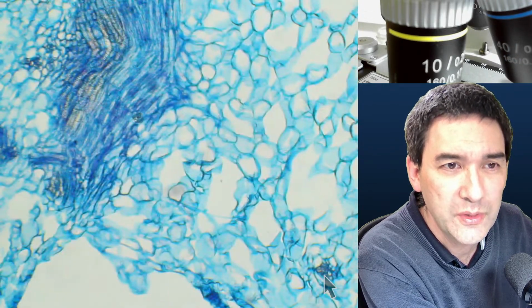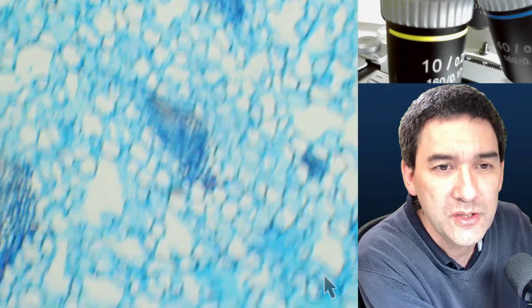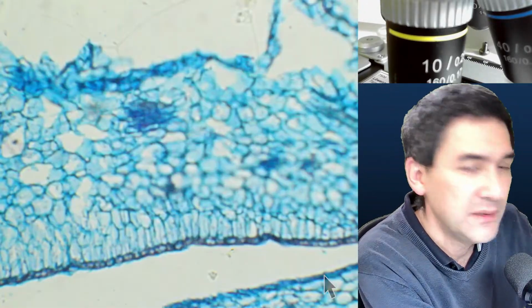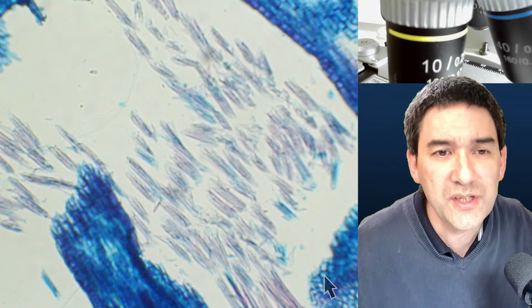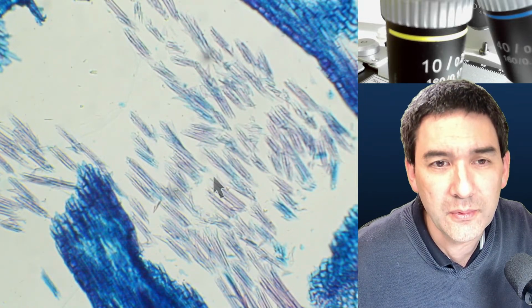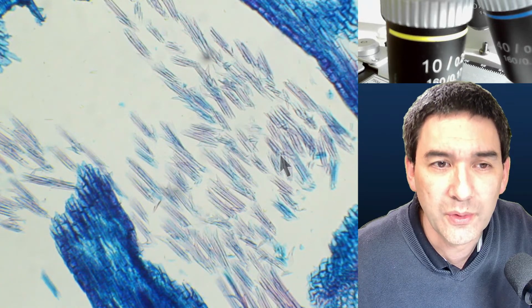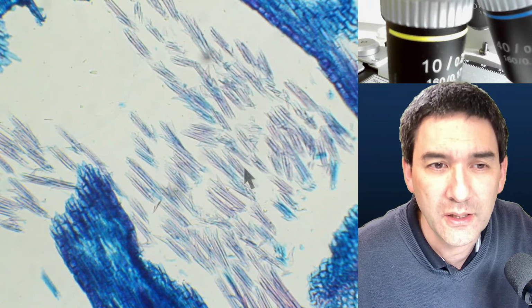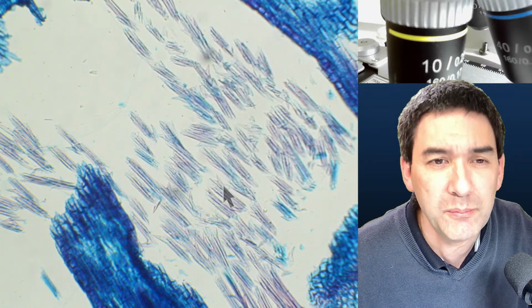So again, this is in bright field. I'm going to close down the condenser a bit again, so we see different types of cells here. But there is also somewhere on the side these things that you see here. It's the fluffy part of the dandelion, the tiny little hairs that work like a parachute so that the seed can be carried away.